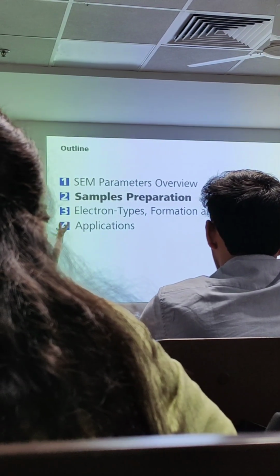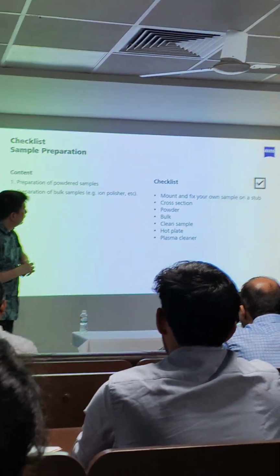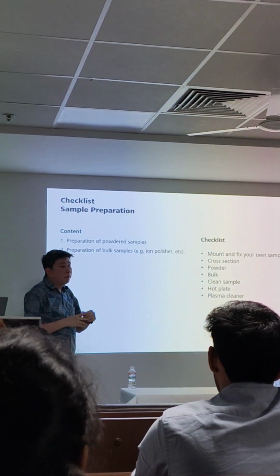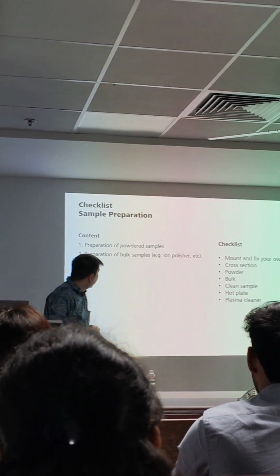Really important. And I hope in the afternoon, when we do the demo, hands-on and so on, I can discuss with you what kind of sample you're working with and what the best practices are. But I will not use this deck. I have a better one to show you how the sample preparation is being done. Bulk samples, powder samples, cross-section samples, and so on and so forth. So we will discuss.